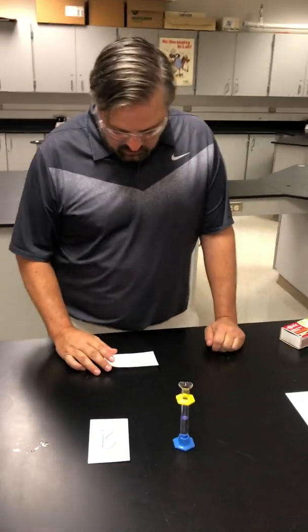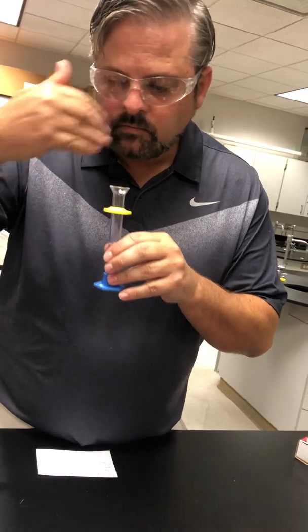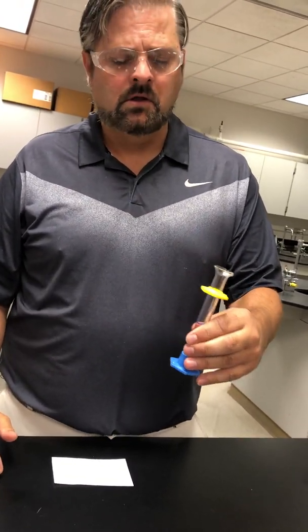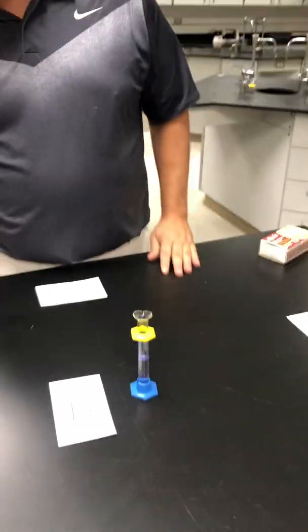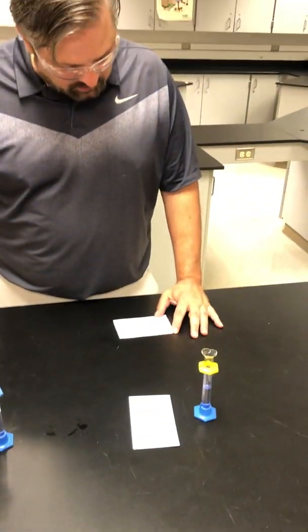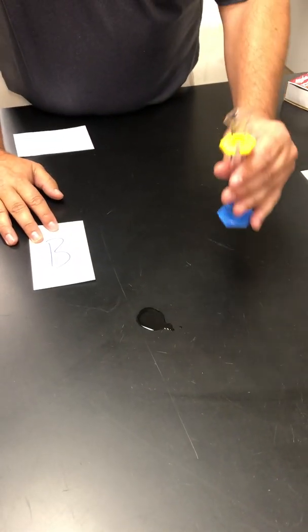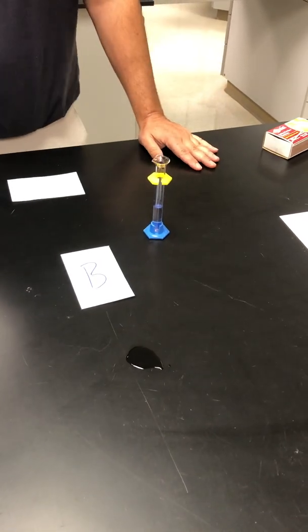All right, so let's look at substance B now. Again, I'll waft and check the odor. Now this one has a smell, it's smelly. So the first one had no odor, and this one has sort of a weird odor. I can't think of a good word to describe it. Let's pour a little bit out. Again, it pours out pretty quickly, so it would have a low viscosity.